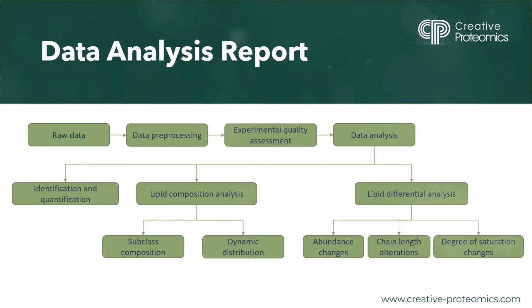Furthermore, we explore alterations in chain length and the degree of saturation within lipid acyl chains. These parameters play a crucial role in lipid function. Statistical methods allow us to assess the significance of these changes between sample groups.